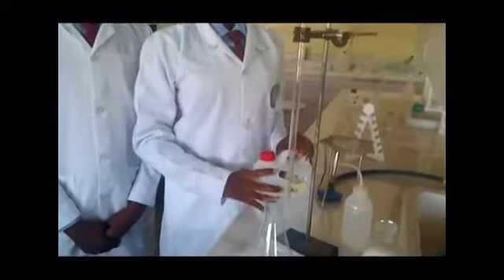And what are the procedures for redox titration? The same procedures for acid-base titration are applicable, except that no indicator is required. And what are the apparatus used for redox titration? The same apparatus used for acid-base titration are also required here, except that we use our Bunsen burner and our measuring cylinder. Other apparatus include the burette, our funnel, the conical flask, our reducing agent, and our oxidizing agent.